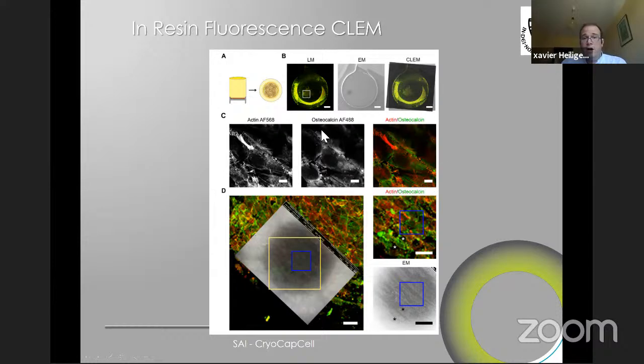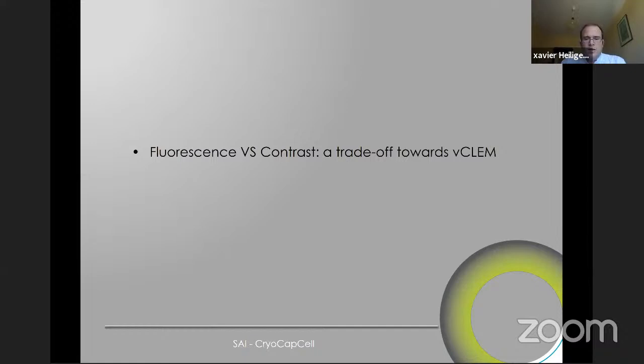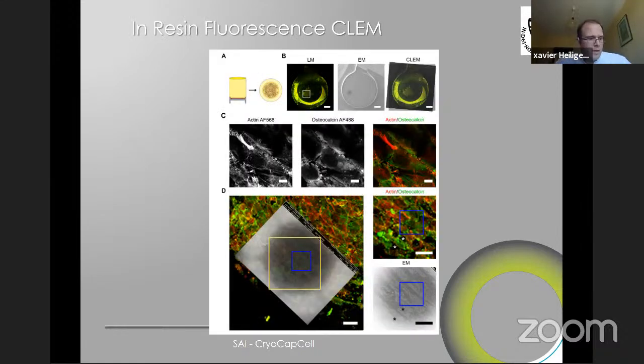Then you can have a higher magnification of your structure of interest and find back your structure by electron microscopy to do your structural identification. So this work is currently being written down, and we hope to publish a book chapter in the coming few weeks, together with Paul Verkade and Thomas Müller-Reichert, as Claudio mentioned before.